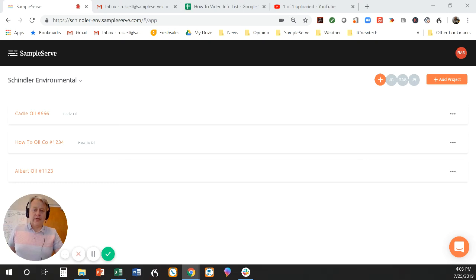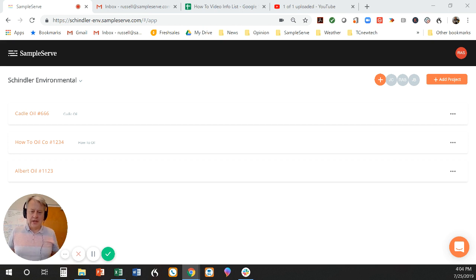Hi, I'm Russell, and in this video I'm going to show you how to locate well locations or sample locations on a sitemap, and how to get that location to stay on that sitemap.